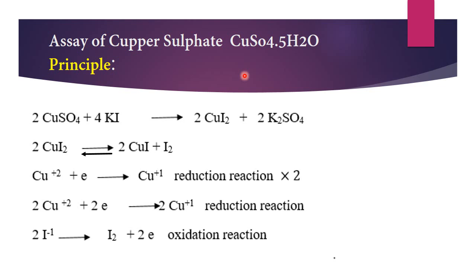So by equations، نشوف إنه عندي CuSO4 chemical compound الموجود عندي plus excess of potassium iodide راح يعطيني cupric iodide plus K2SO4. احنا قلنا الكبريك iodide is unstable, so it decomposes to give cuprous iodide with liberation of iodine.